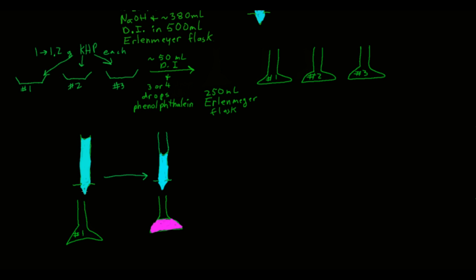When you add the first drop of sodium hydroxide that makes the solution in the Erlenmeyer flask turn pink and stay pink for at least 30 seconds, stop and record that volume — that's the final volume of sodium hydroxide solution for flask number one. Repeat the same procedure for flasks number two and three.